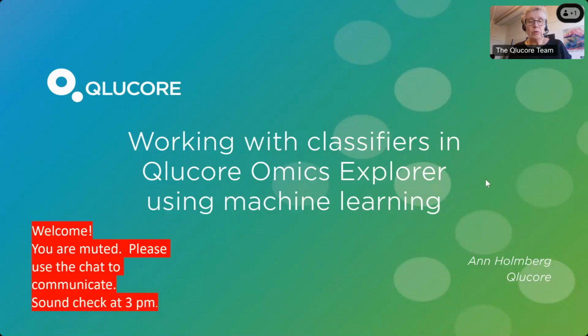So today we're going to talk about how we can work with classifiers in Qlucore Omics Explorer using the built-in machine learning capabilities. I'm Ann Holmberg from Qlucore, and I will guide you through this.